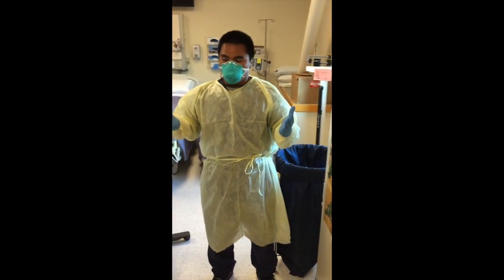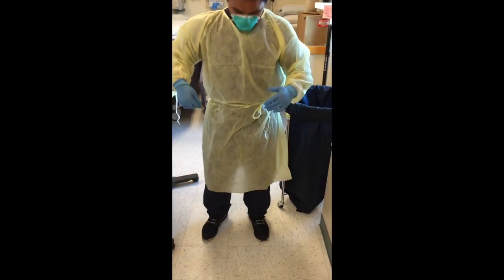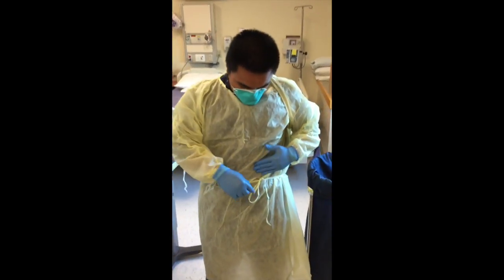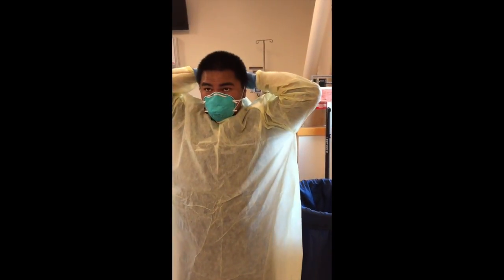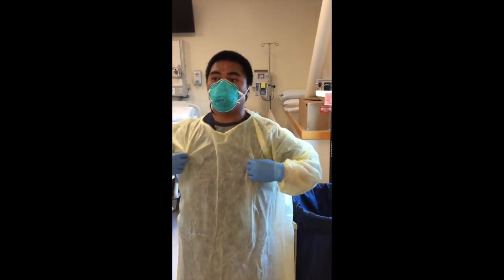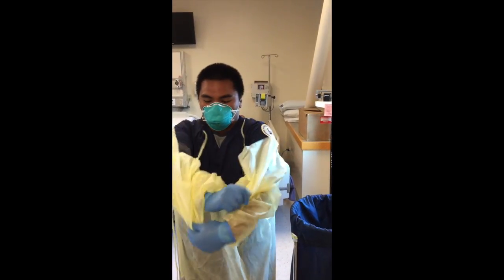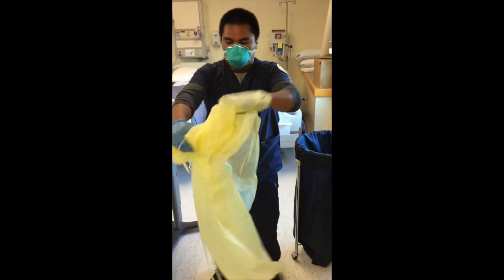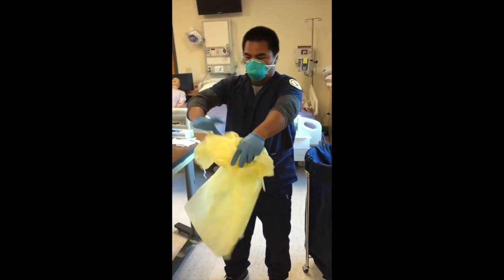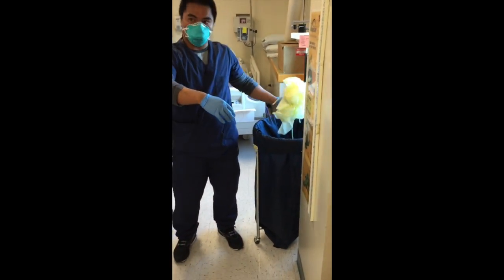The first thing I'm going to do is take off my shoe covers, and then I'm going to take off my gown. Make sure you don't touch yourself. I would go crisscross and roll it away from me. There we go. And then they'll have a designated barrel to put your stuff away.